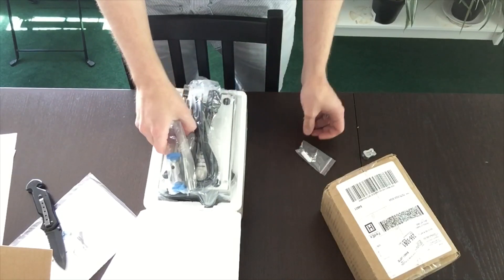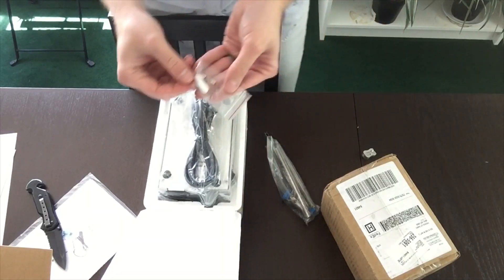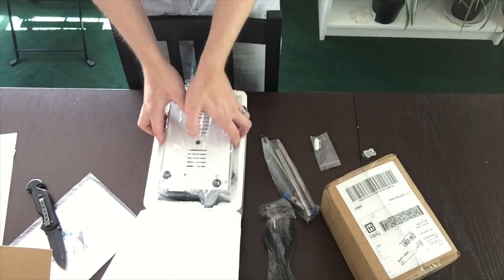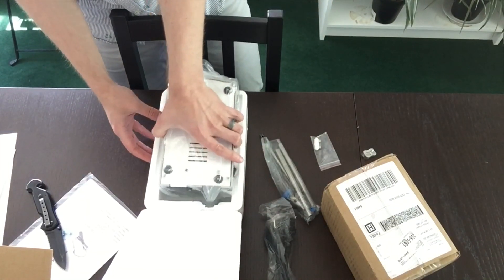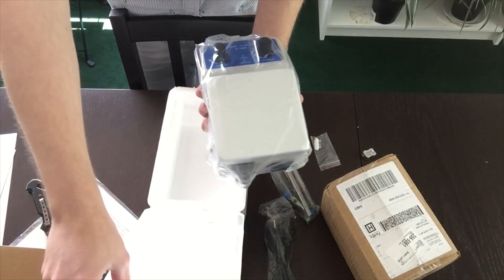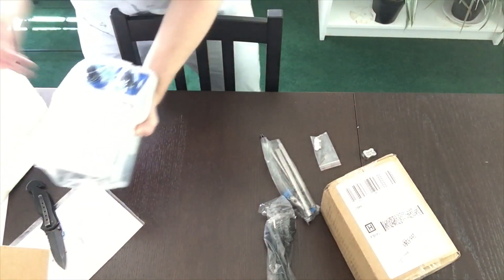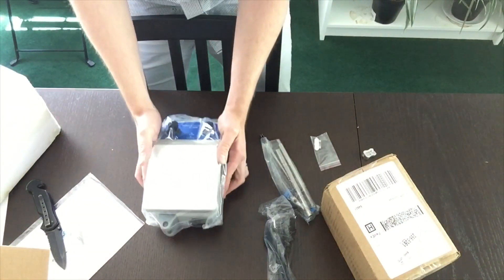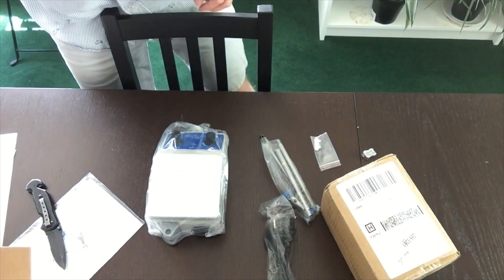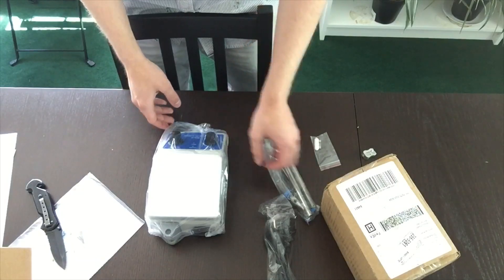This particular model seems to be popular — you can see there are a bunch of copies of it. There was even an ad that said 'ours is genuine' and that the SH-2 is a copy or rip-off. But they're pretty much all the same model as far as I could tell just by looking at pictures, and it seems to be the way it goes when you're buying stuff off eBay — everyone resells it.